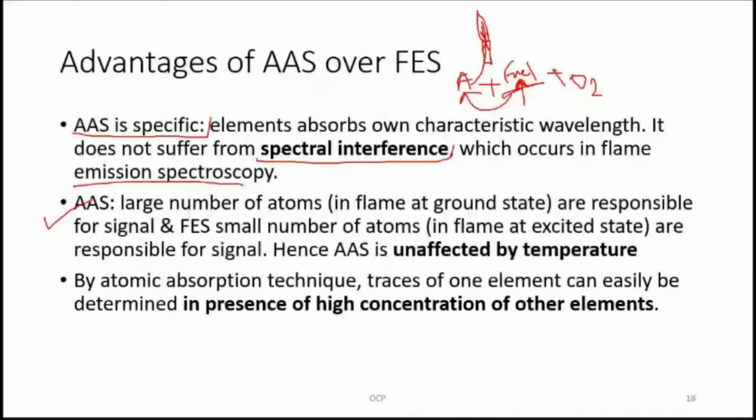Third, by atomic absorption technique, traces of one element can be determined in the presence of high concentration of other elements. This will not be possible in case of FES because of high interference.